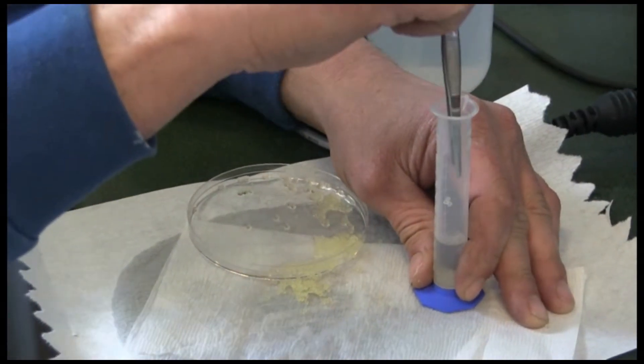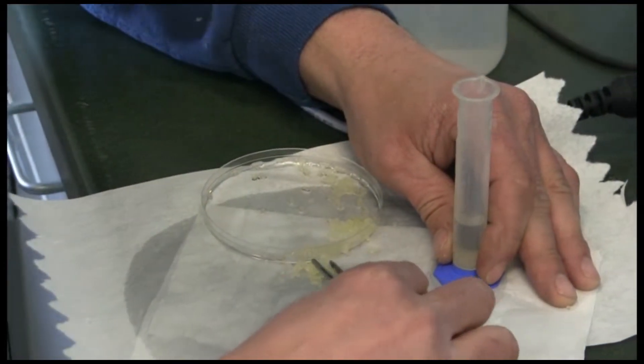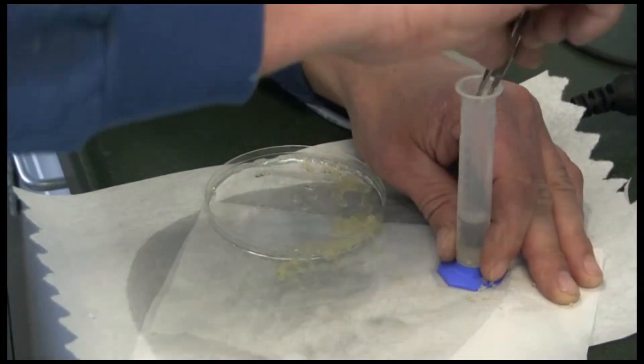Gently begin adding eggs to the water in your cylinder. Do not pop the eggs during this process. Add enough eggs to raise the water level by 1 milliliter.